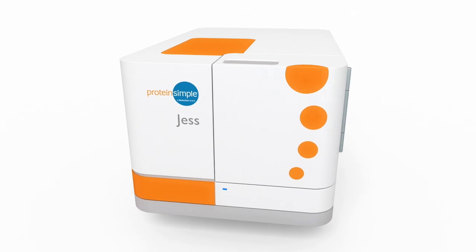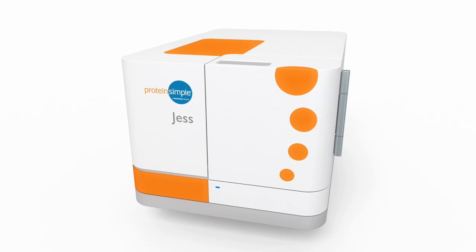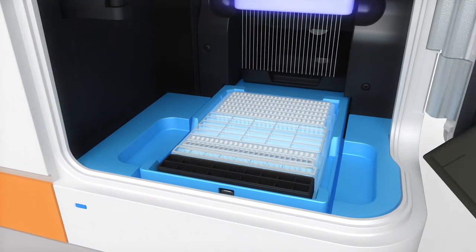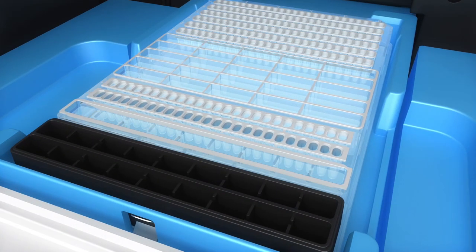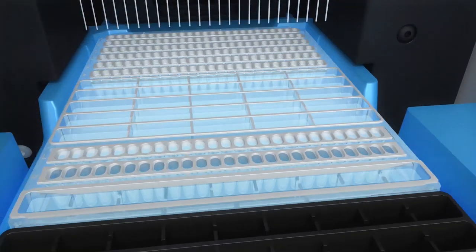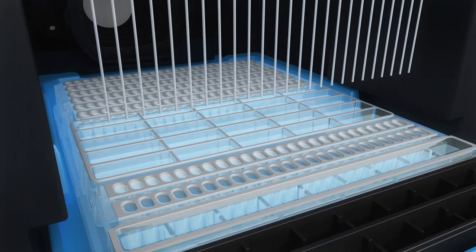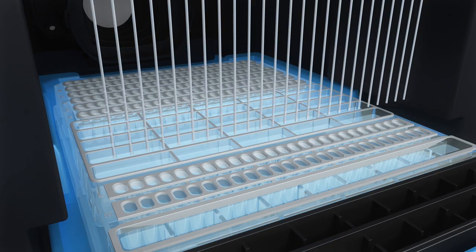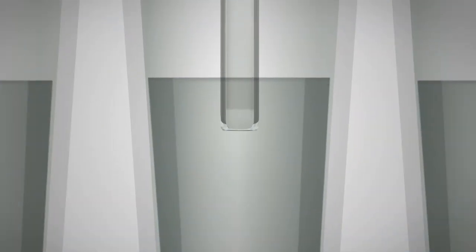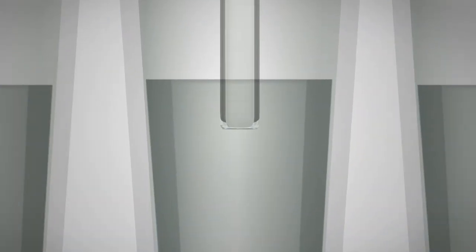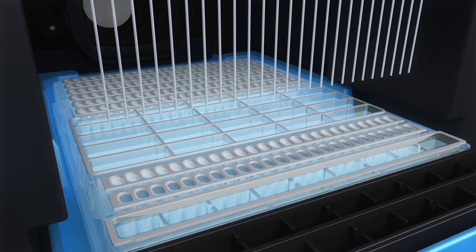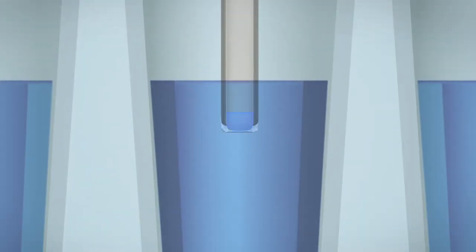Simple Western immunoassays take place in a capillary. Your sample, separation matrix, stacking matrix, antibodies, and reagents are loaded automatically from a specially designed plate. Jess begins by aspirating the separation matrix and then the stacking matrix into each capillary.